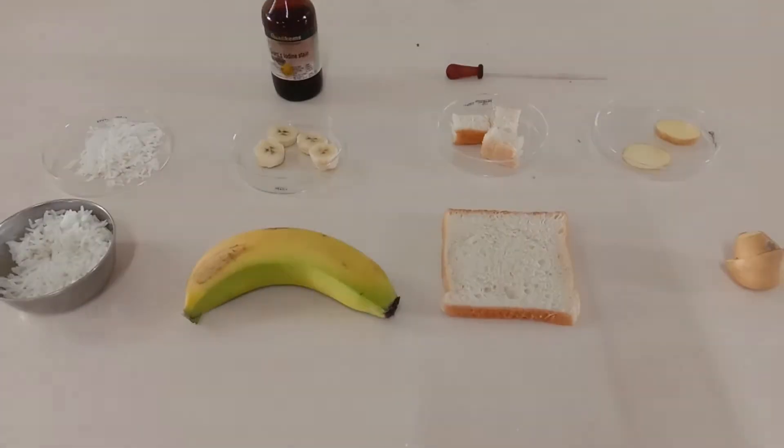Hello scientific audience, hope you all are doing fine. Today I am going to perform a demonstration to detect the presence of starch in food items. Starch is a soft white tasteless polymer comprising of glucose molecules. It is insoluble in water and produced by all green plants. This experiment is very important for grade 9 students as a part of their curriculum.